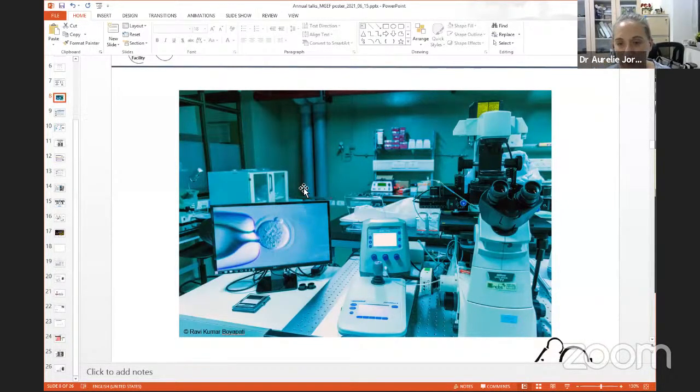So there's different versions of this. This is a motorized micromanipulator. Narishige has some manual manipulators. They both work. We have both actually in the facility. And usually people just end up buying the equipment that they've been trained on, and they stay on that. But yeah, both work well.